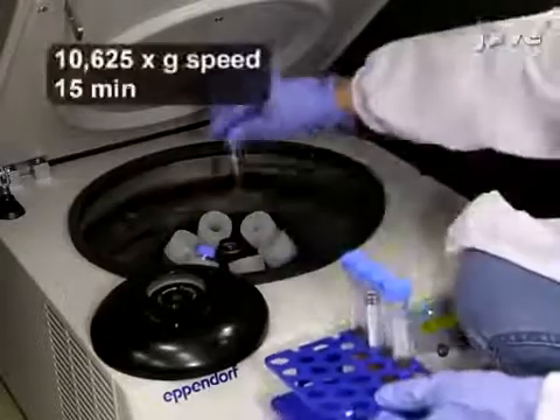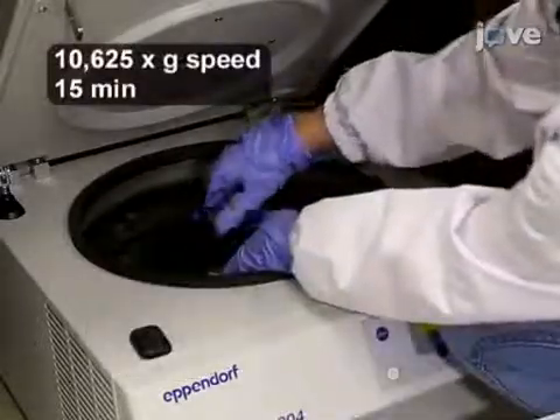Next, centrifuge the solution two times to remove the unexfoliated large graphene oxide sheet precipitates.